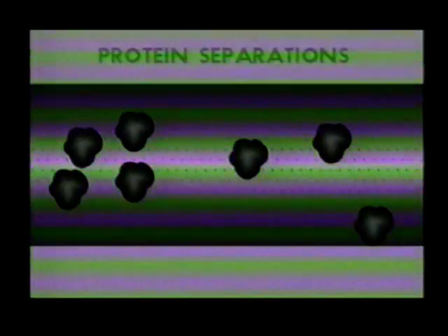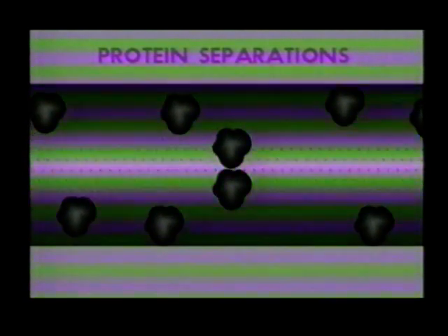The coupling of mass spectrometry to CE provides mass-selective detection and, ultimately, structural information. Two types of interface have been developed: electrospray ionization, or ESI, and one which depends on fast atom bombardment, or FAB, to produce molecular ions. Typical CE-MS detection limits are of the order of 10 to the minus 5 molar.